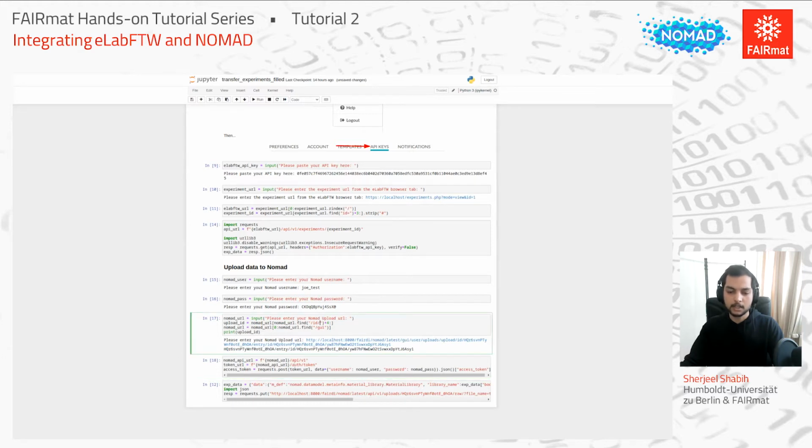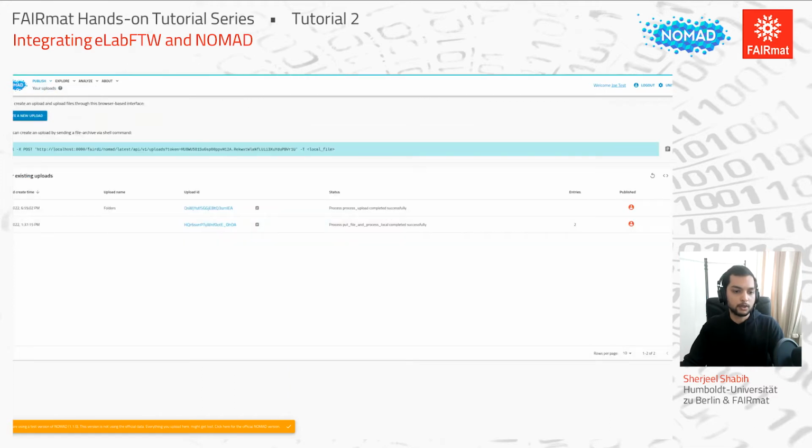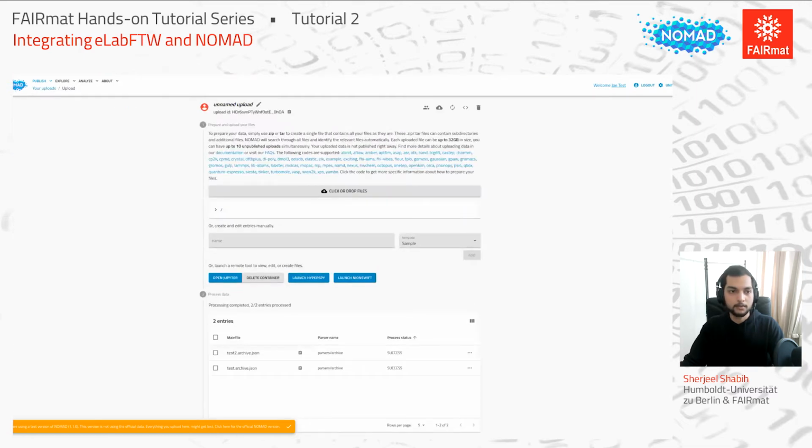not just anyone who has access to this instance. So to get this upload URL with this upload ID, you can actually come to the upload section of Nomad, create a new upload. And when you do this, there is a new entry down here. And if you go into this entry, you can see that there is a URL up here, which gives you your upload ID, and it also lists which domain you're accessing this instance of Nomad at. So just using this URL, you get most of the information you need.